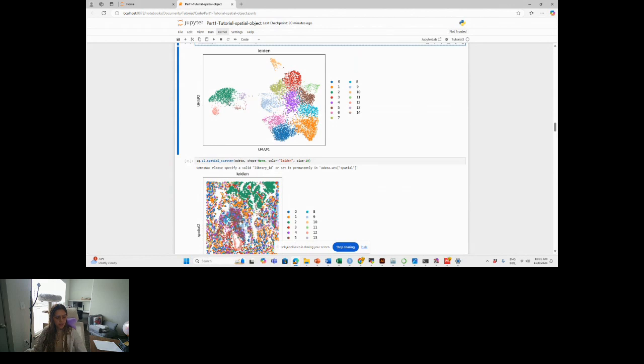Okay, so as we can see, for example, the color that is on the left, that is green, corresponds to cluster number 2. And those can possibly be identified as one specific cell type. All these cells share a similar gene expression.